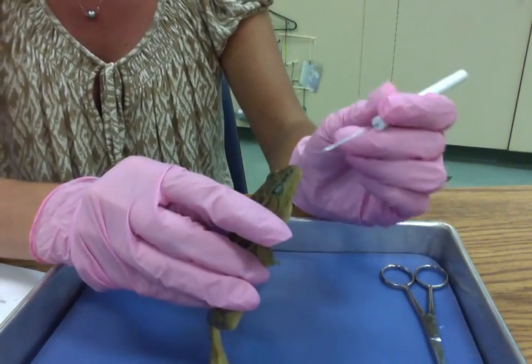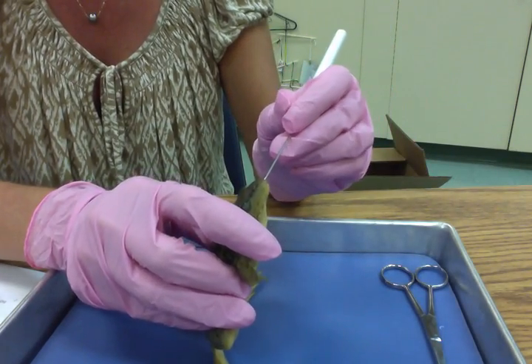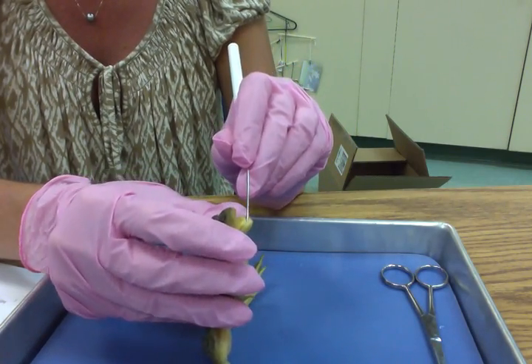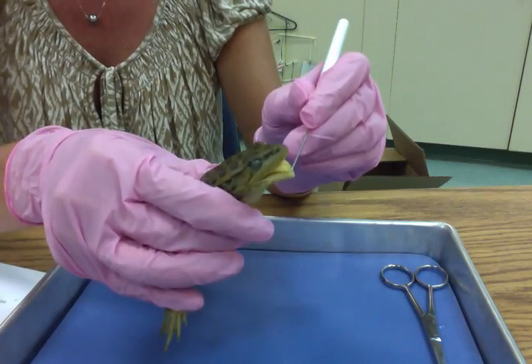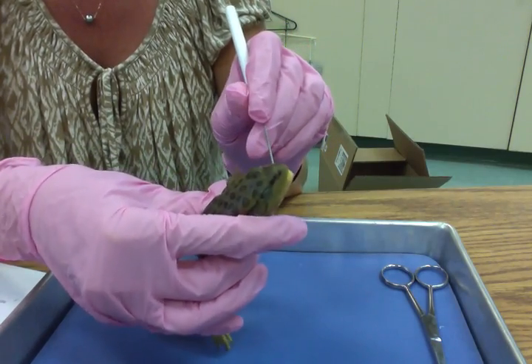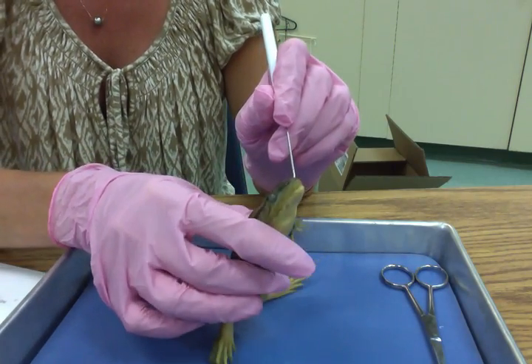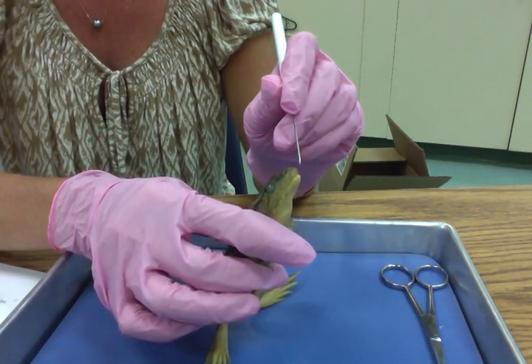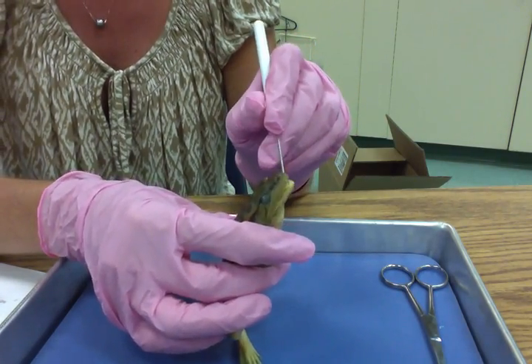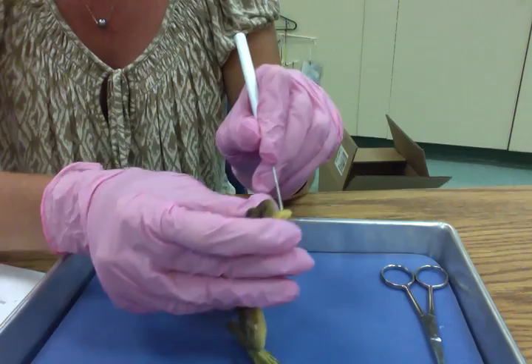Next, you're going to use your probe. This is the probe to open and close the frog's mouth. Observe the teeth. Observe the movement of the mandible, the jaw, right? And next, we're going to actually pull the tongue out.